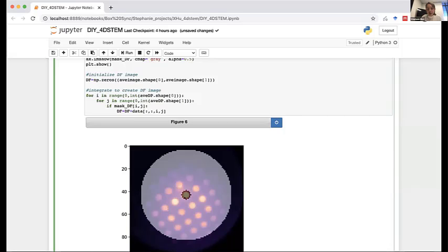You could tune this. This is one power of scanning diffraction, the same thing as in Digital Micrograph that Anna showed. You're setting your dark field to be just right outside your central disk, but you can change your inner and outer diameter. So from the same data set, you could do a HAADF image, a mid-angle dark field, or a low-angle dark field. Here I'm integrating most of the dark field region to get an image.